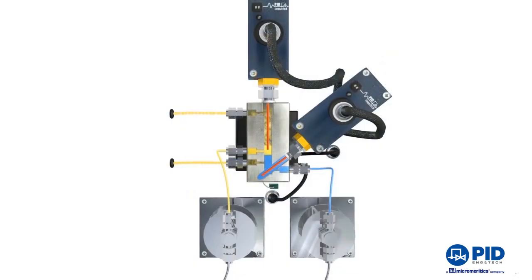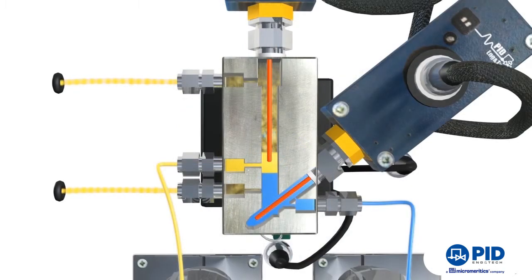In the L2 separator, each sensor is calibrated for one of the liquids. Thus, the hydrocarbon level sensor is fixed at the top so that it only comes into contact with the lighter phase, whereas the water level sensor is at a lower position.